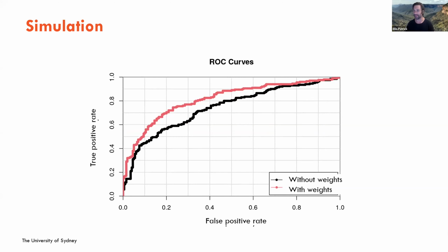Like any method that you develop, you can always construct some sort of simulation that demonstrates that it's the type of thing you would like to use. And that's what we can do. We can generate simulations and show that including these weight scores is useful.